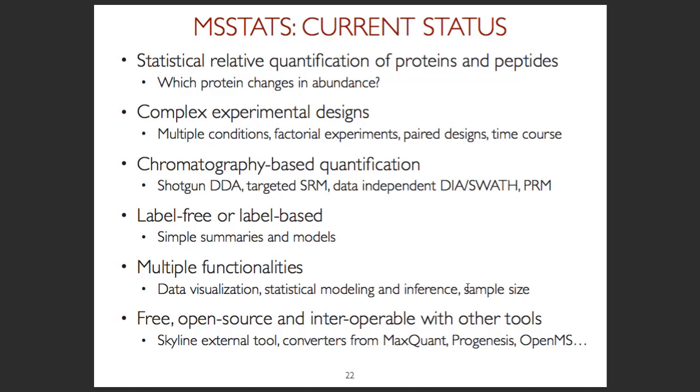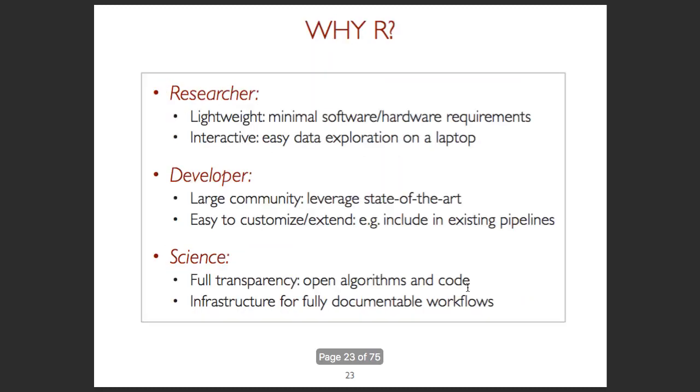Some of the methods are implemented in Skyline. However, most methods are implemented within R. So other tools have just a subset of what we do. The most complete framework is within R and within MSstats. And to answer a fairly frequent question of why R, well, I hope by now you have a sense that we like R quite a bit, right?